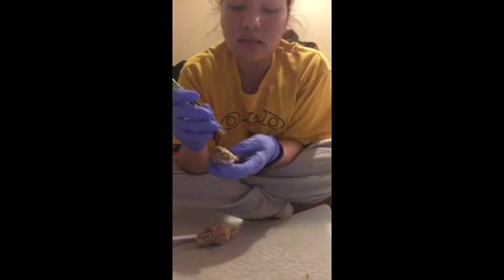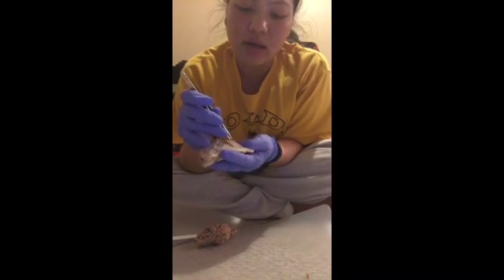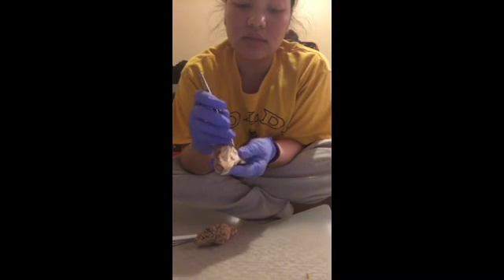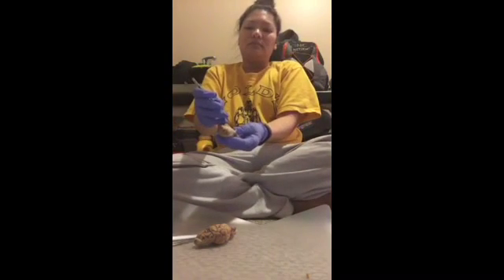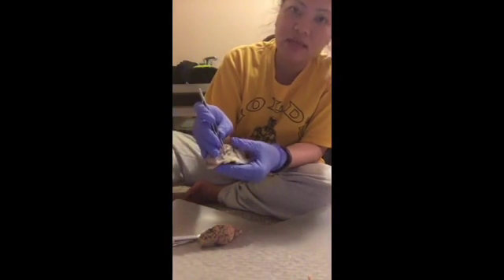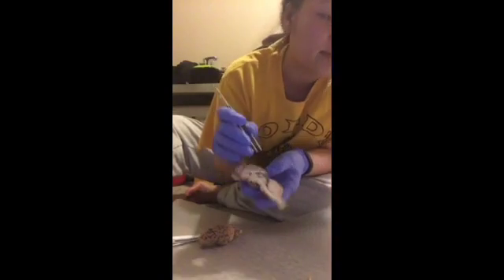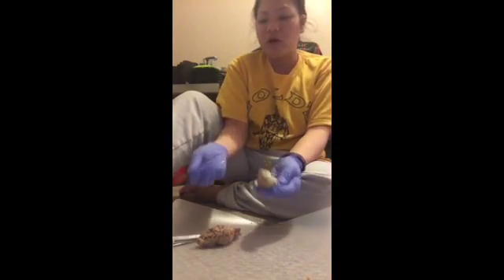The cerebellum with the arbor vitae. The arbor vitae is the white matter. So this is the arbor vitae right here. The pineal body is this one. This is the pineal body. And last but not least is the intermediate mass of the thalamus, which is right here. That's the intermediate mass of the thalamus. So that's the sheep brain parts.